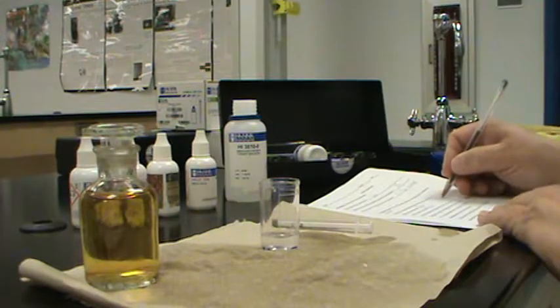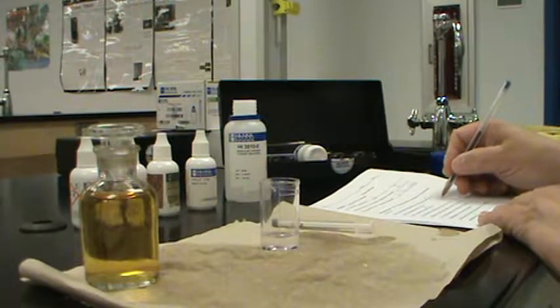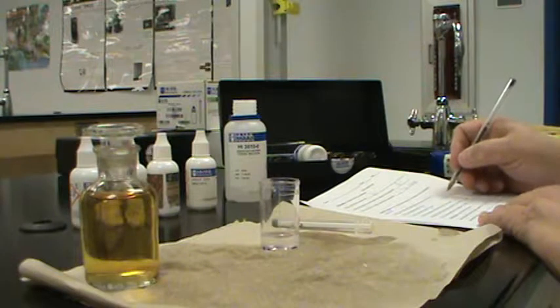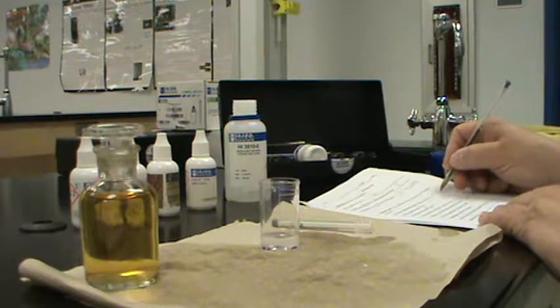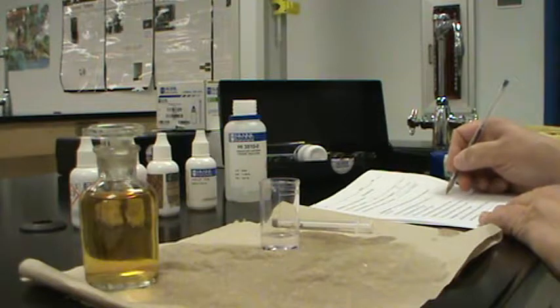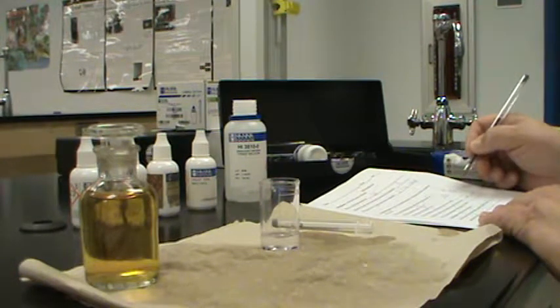So we used 16 drops, and each drop is 3/100ths of a milliliter. So 16 over 1 times 3/100 equals, let's see, 16 times 3 is 48. We have 48/100ths.